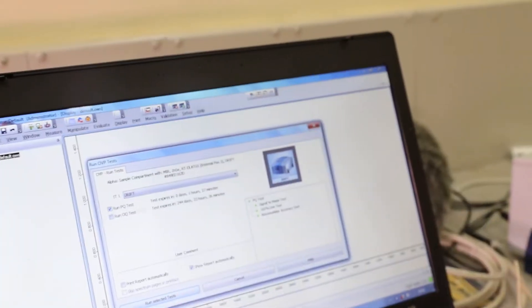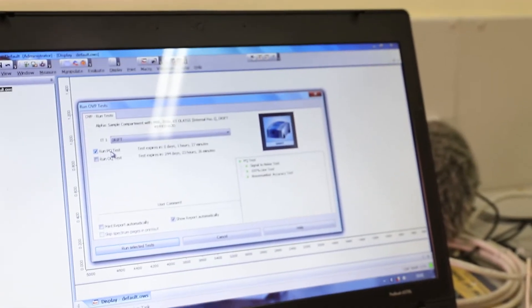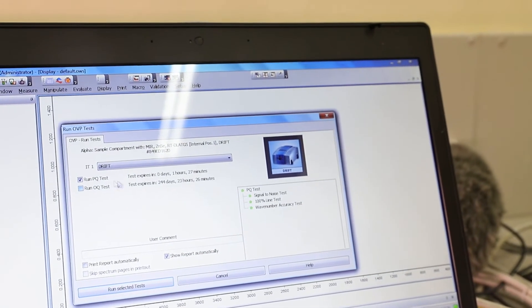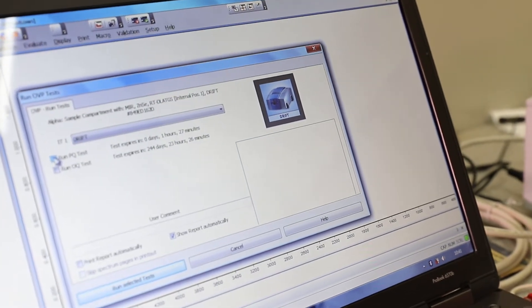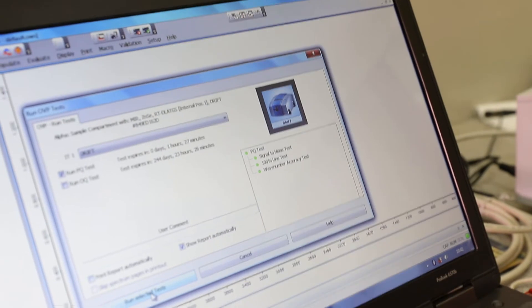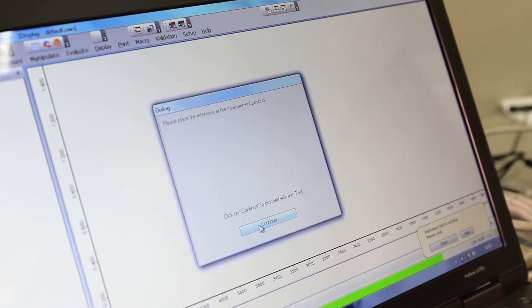We do our tests. We have two tests: the PQ, which is the Performance Qualification, and the OQ, which is the Operations Qualification. For the PQ you run it weekly; for the OQ you run it every year. You put a tick on the Performance Qualification and go to Run Selected Tests, then click Continue.